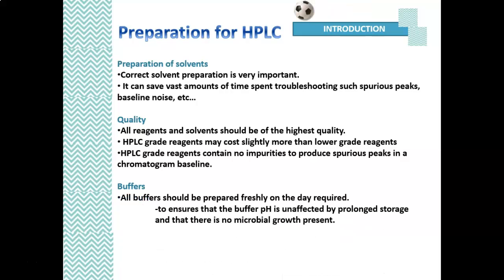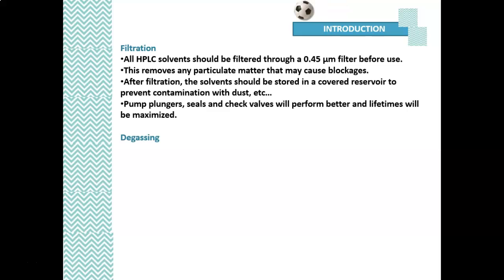And buffers: all buffers should be prepared freshly on the day required. We use freshly prepared buffer because we want to ensure that the buffer pH is unaffected by prolonged storage and that there is no microbial growth present. Next, you must do filtration.